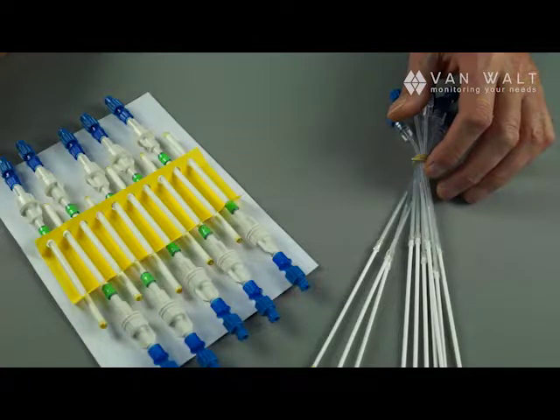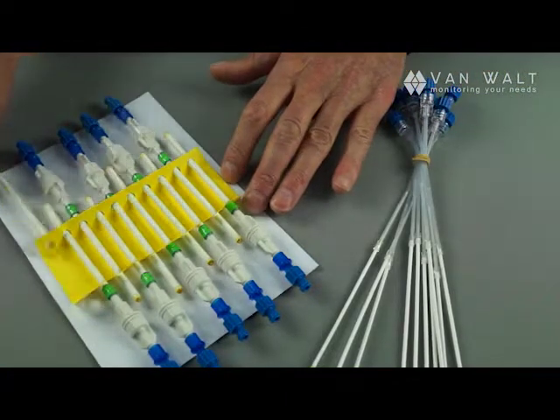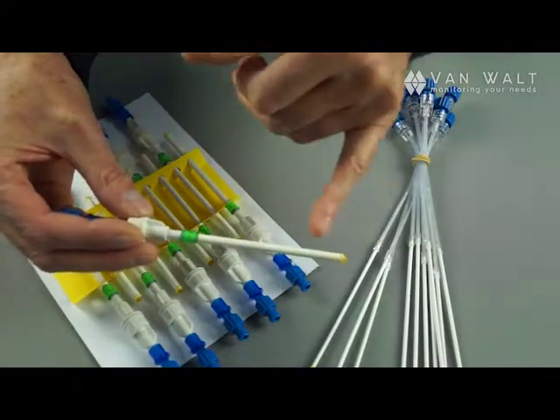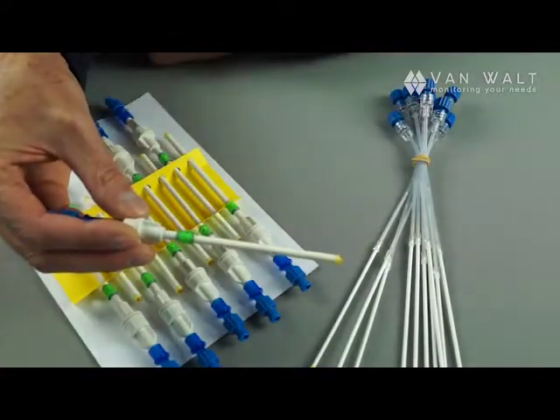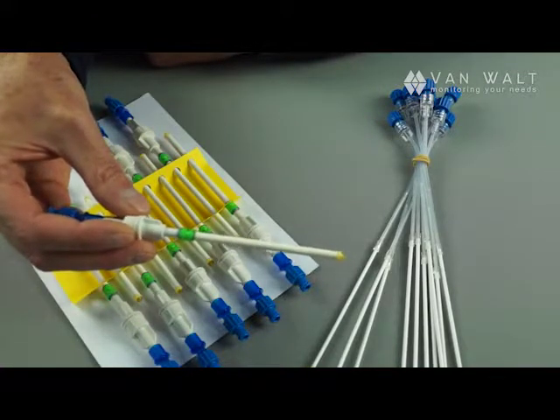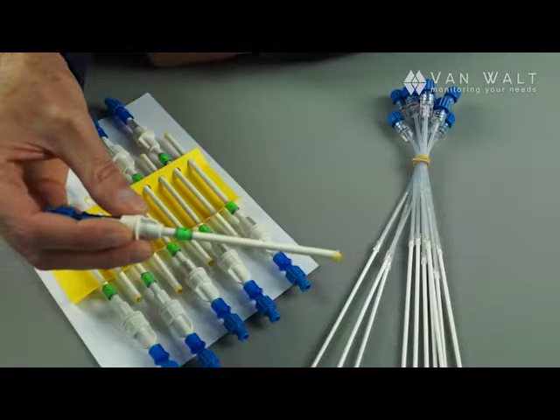If you're working in the field or outside of the laboratory you may also require a larger sampler. Then the macro rhizomes are also available. These are nine centimeters in length with a diameter of four and a half millimeters, but that does enable you to take slightly larger volume samples up to about 30 milliliters.